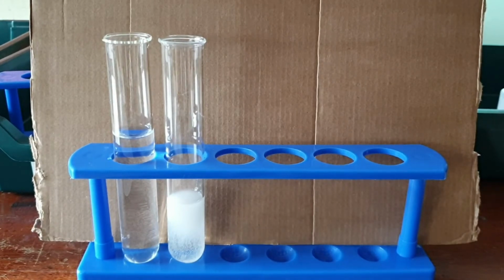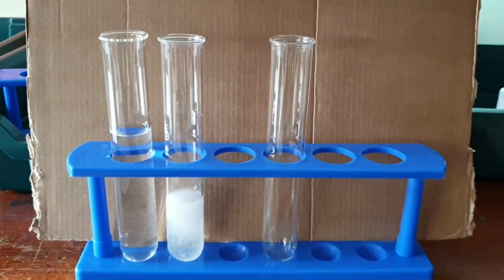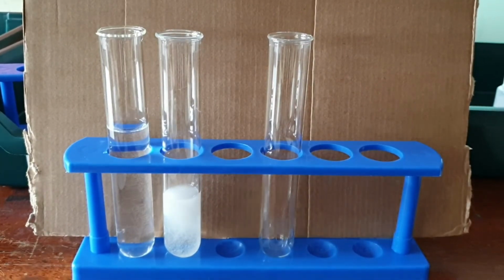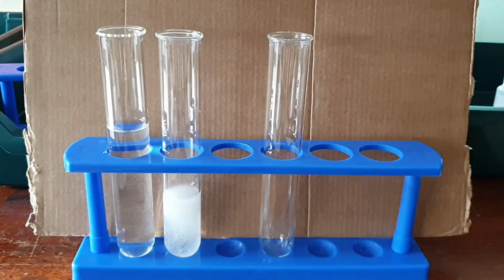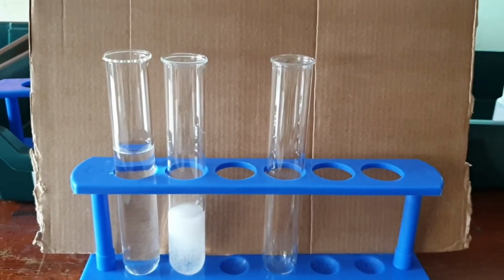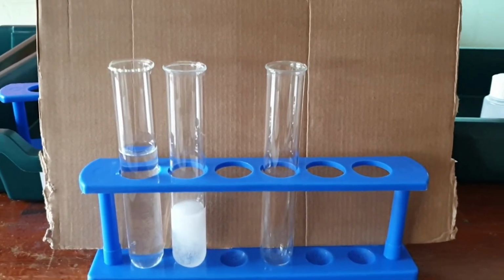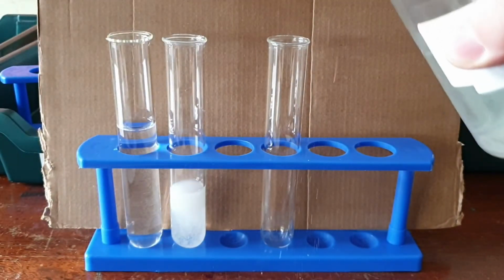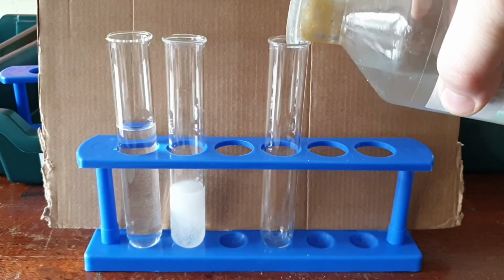I'm going to get my test tube and put my mystery substance in, that I want to find out if it's a carbonate. Spoilers, it is a carbonate. Has it got carbonate ions in it?